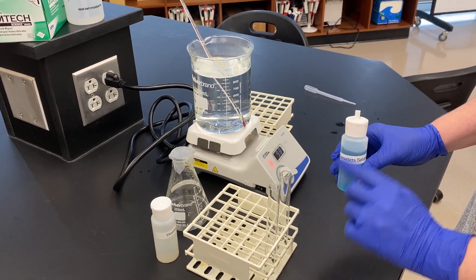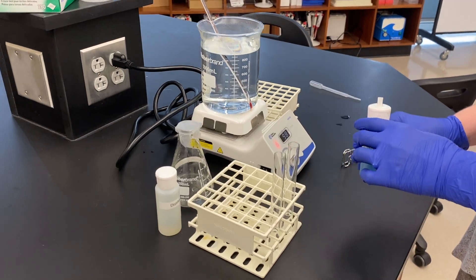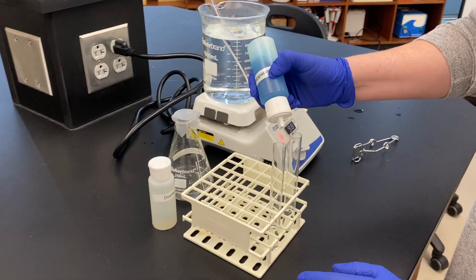We're going to put 20 drops into each one of these tubes. These tubes already contain five milliliters of water, so I'm going to add 20 drops to each.